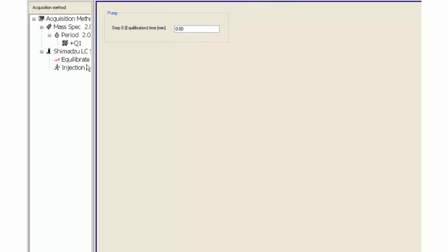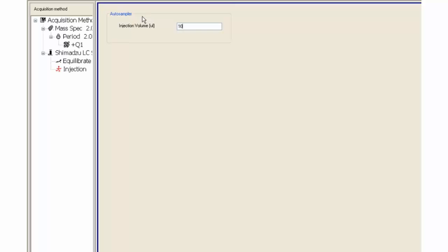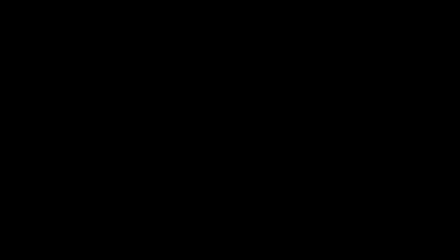Click on the Injection option and enter a reasonable injection volume. This is based on the sample concentration in LC injection and column limitations. Save the method.